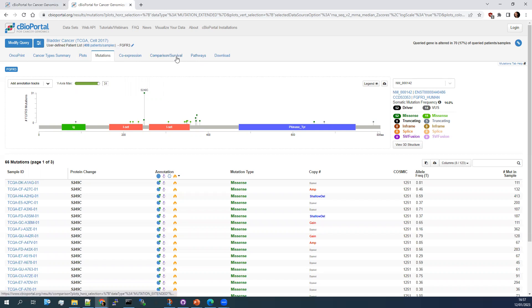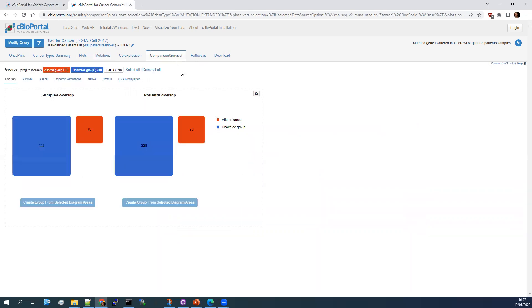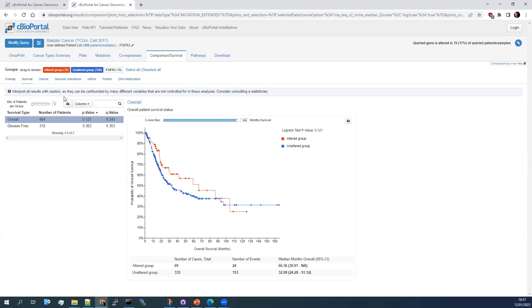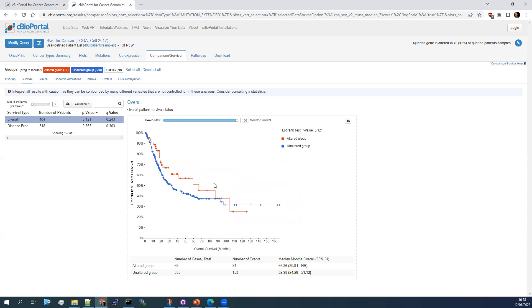Just like with the other things we've looked at so far, you can start looking at things like survival. So you go into the comparison section, look at things like survival, and you can see that whilst it's tending towards the FGFR3 mutated tumors have a better survival, it's not a significant difference.